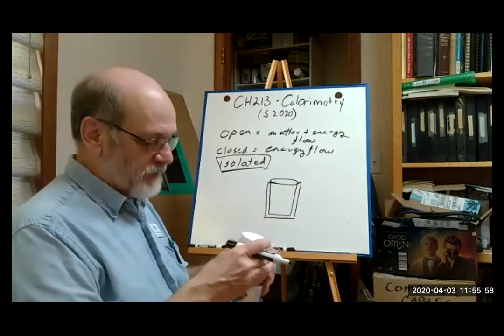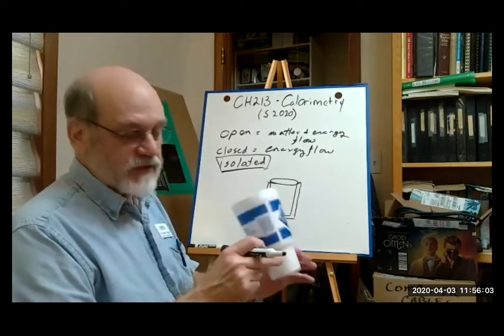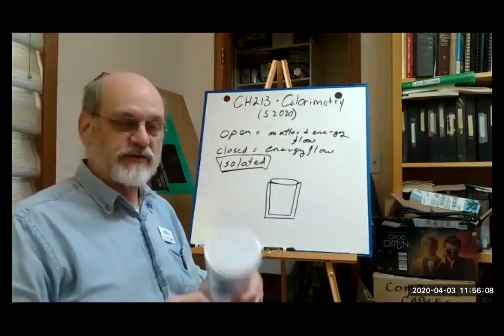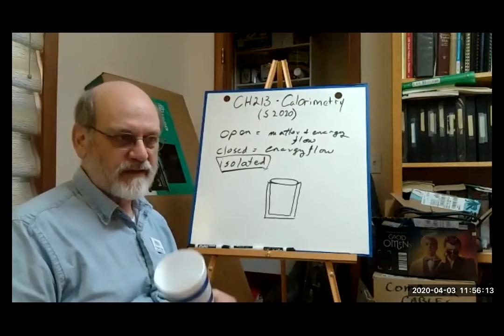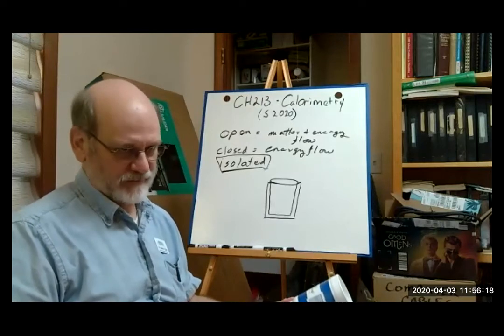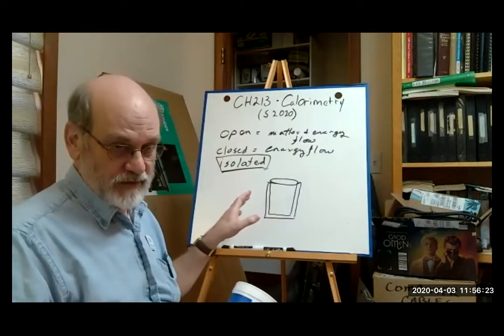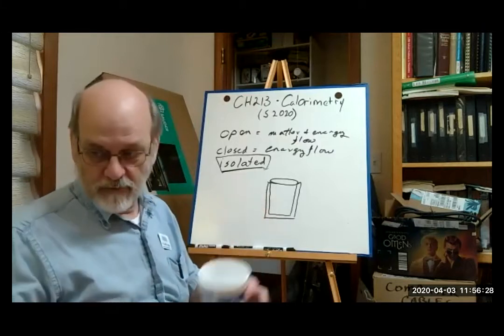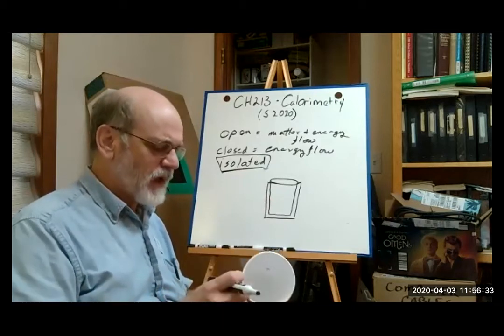So when we double it up, there's nothing getting across that boundary, as long as it's water-based. Because anybody who's ever used a styrofoam cooler knows you don't spill lighter fluid, gasoline, any hydrocarbon like that on your styrofoam, it will immediately melt it. So the types of reactions we can conduct inside this calorimeter must be water-based. And fortunately, all the parts of our experiment today are water-based.